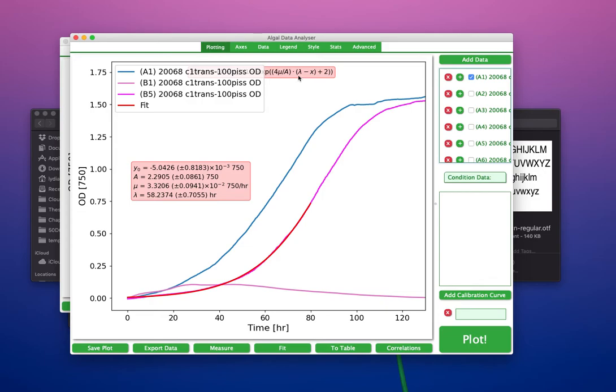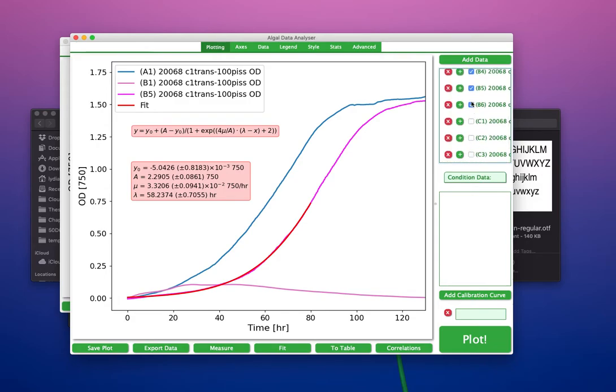Okay, great. So, it's good generally to make sure the model does fit individually to all your lines. But if you're in a massive rush, you want to really quickly compare it, what you can do is use the table function. So here I'm just going to decide to plot all of my different reactors together.